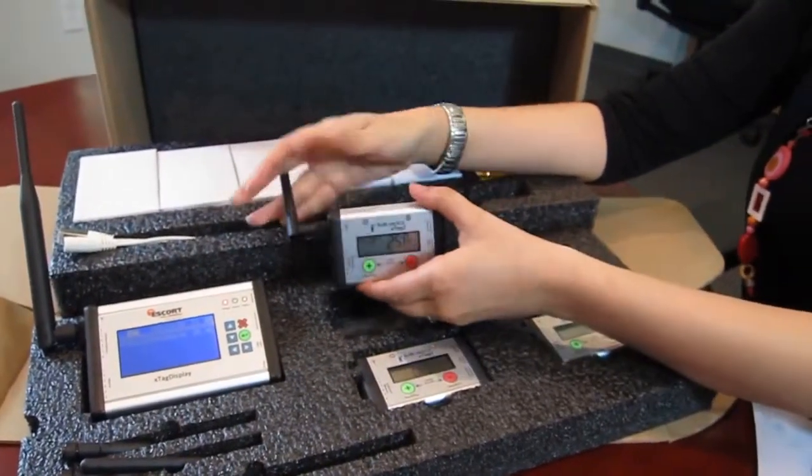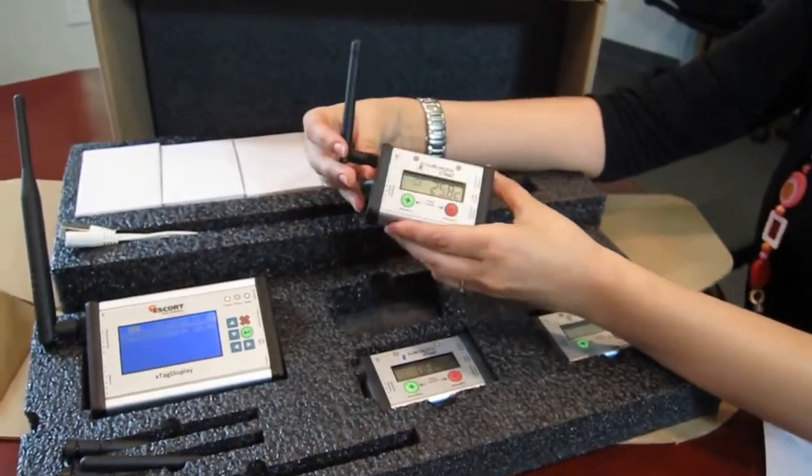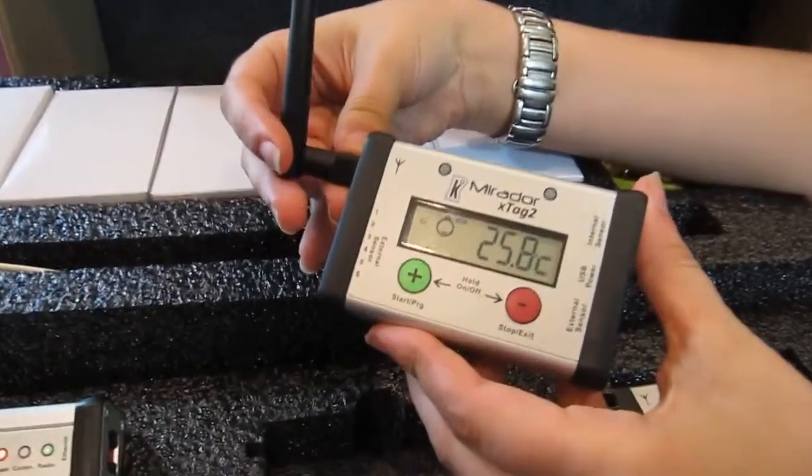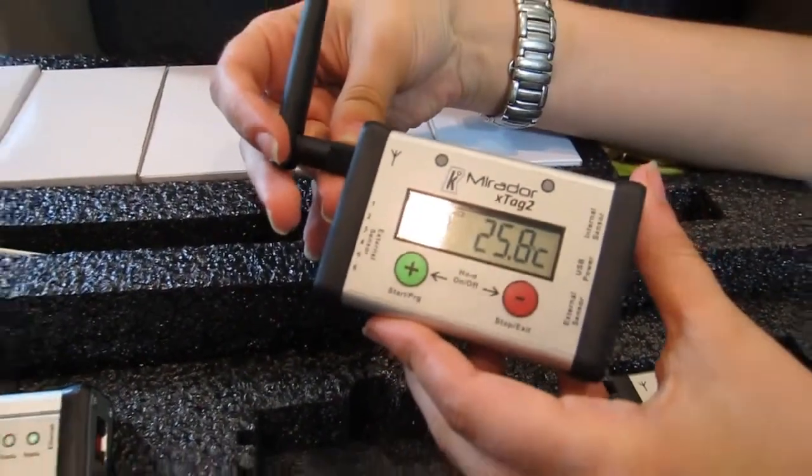It uses the X-Tag Display and the X-Tag 2 that you see right here. How it works? This little wireless sensor is going to record temperature inside your warehouse, your fridges, your freezers or any other thermal equipment that you might have.